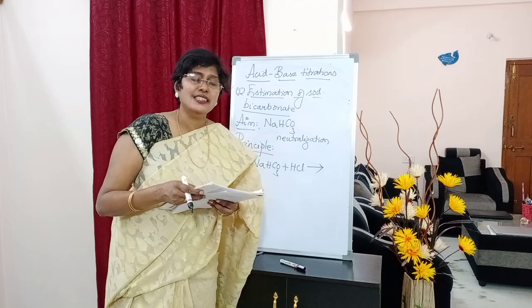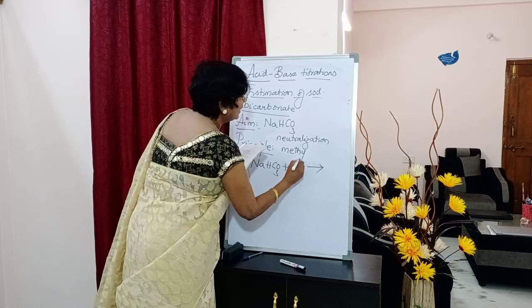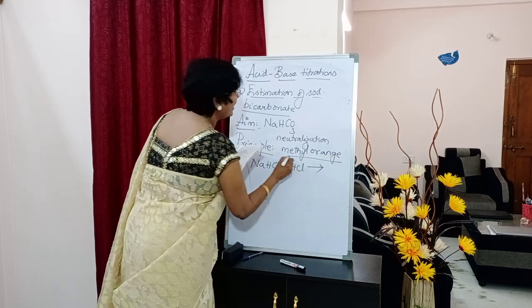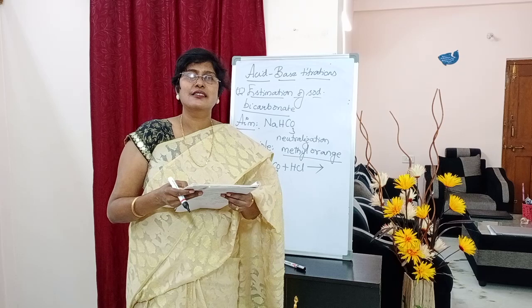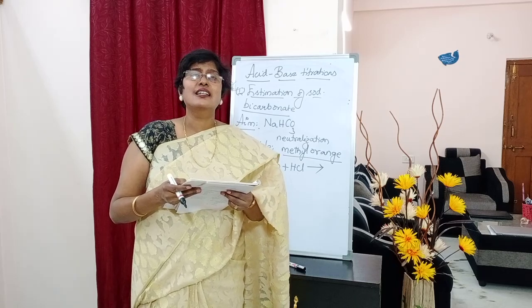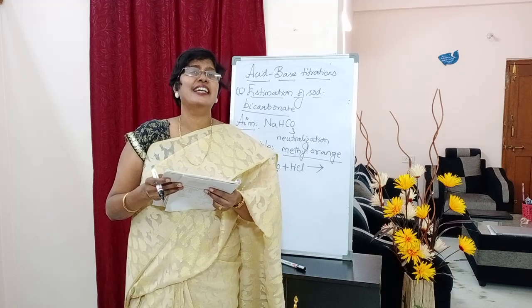Methyl orange indicator. Written students. NaHCO3 reacts with the HCl and the neutralization point can be detected using methyl orange indicator.